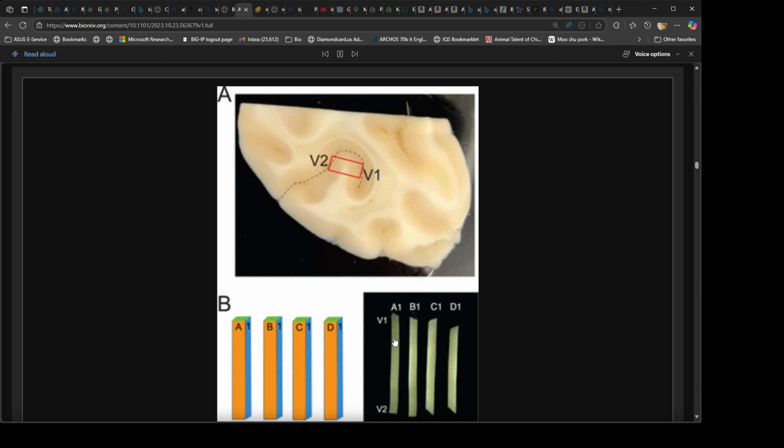Each pillar was then stained and embedded in a hard plastic resin using established EM protocols, which provide high contrast and physical stability for XCT imaging, Figure 3a. We developed custom cylindrical molds that reduce the sharp edges of the resin to minimize X-ray scattering, and that fit into a single field of view, FOV. Adjacent pillars were imaged using XCT at approximately 600 nm3 resolution, and acquisition took approximately 75 minutes to image 1.3 by 10^10 voxels, i.e., 2.9 MHz. See methods for how to access full datasets.